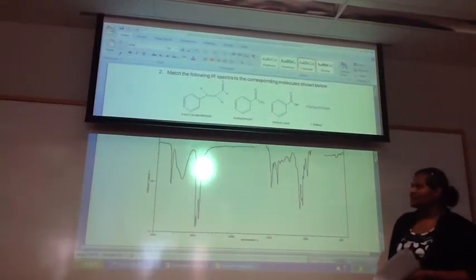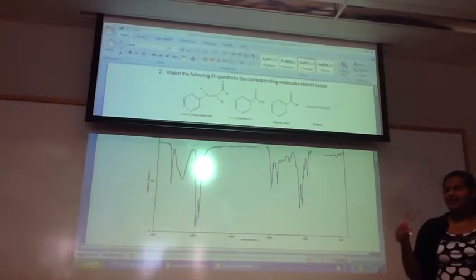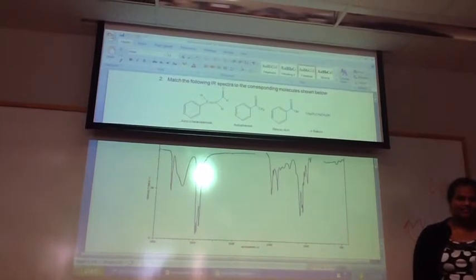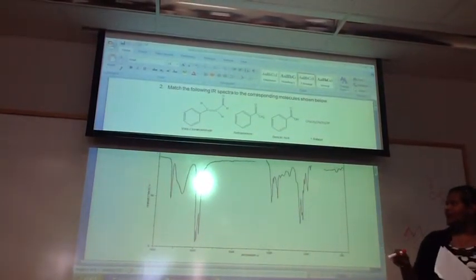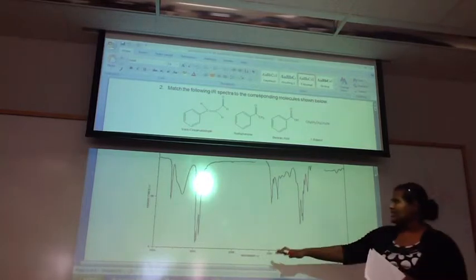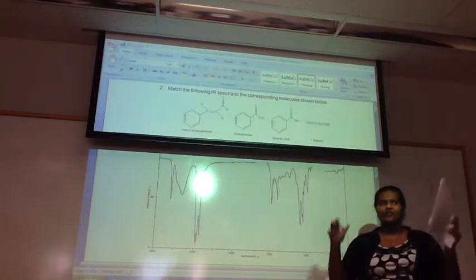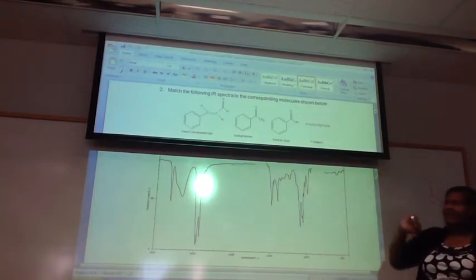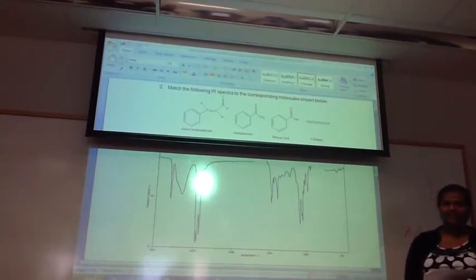Another tip for you for doing IR: two of the main peaks that jump out at you are OH and C double bond O. What's the reason for that? Dipole moment. C double bond O comes in around 1650 and it'll almost touch the baseline, like I mentioned. And OHs are known for being really broad. They're going to be this huge well kind of thing. You see that, and they come in after 3000, so it's in the functional group region and it's well signed.